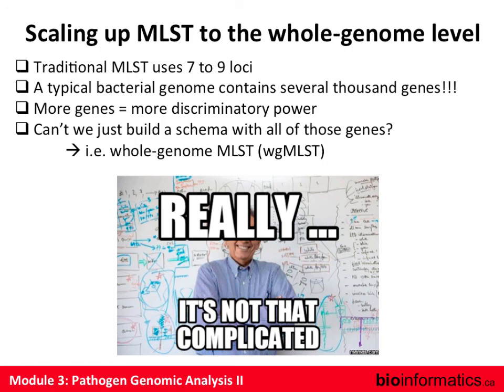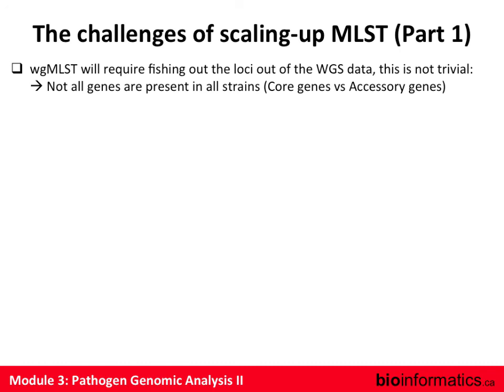I'm going to now show you why it's not as simple as you would think it should be. The first thing is, in the old days of MLST, we would amplify each gene, sequence each gene, nice and slow and steady, and compare the data to the database. Now we're not doing that. We just have sequence data and are trying to bioinformatically extract the data from all the genes. That's not as trivial as you think it should be.